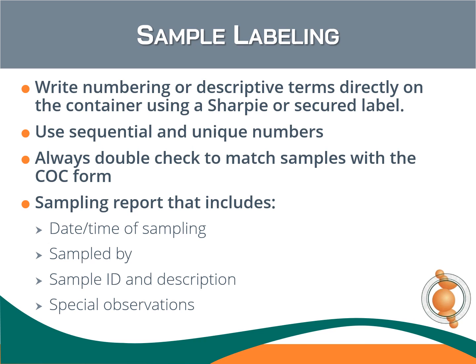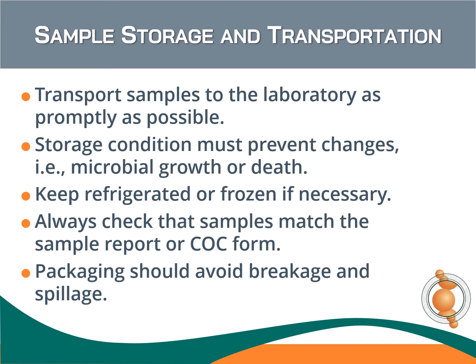An internal sampling report is important and should include the date and time of sampling, who took the samples, the sample identification and description, and any special observations. Schedule transport to the laboratory as promptly as possible.